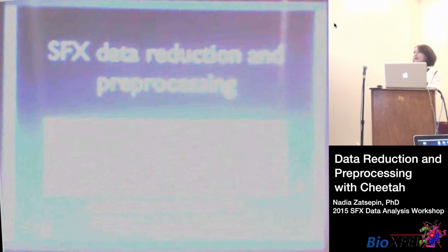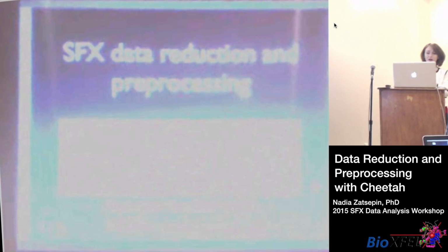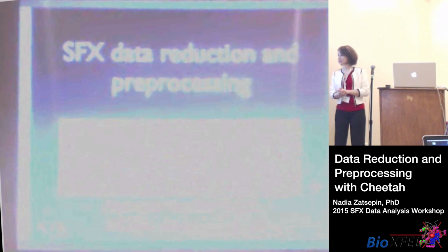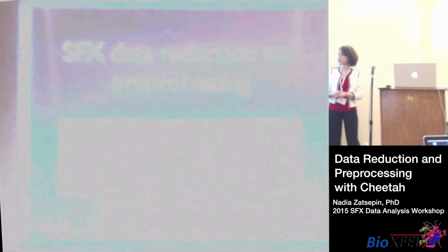Firstly, I will say that a lot of these slides, actually almost all of these slides, are from Anton Barty, the lead developer of Cheetah, the data reduction and preprocessing software. He wasn't able to be with us, so I'm giving this part of the talk. This is the main reference for the Cheetah software.